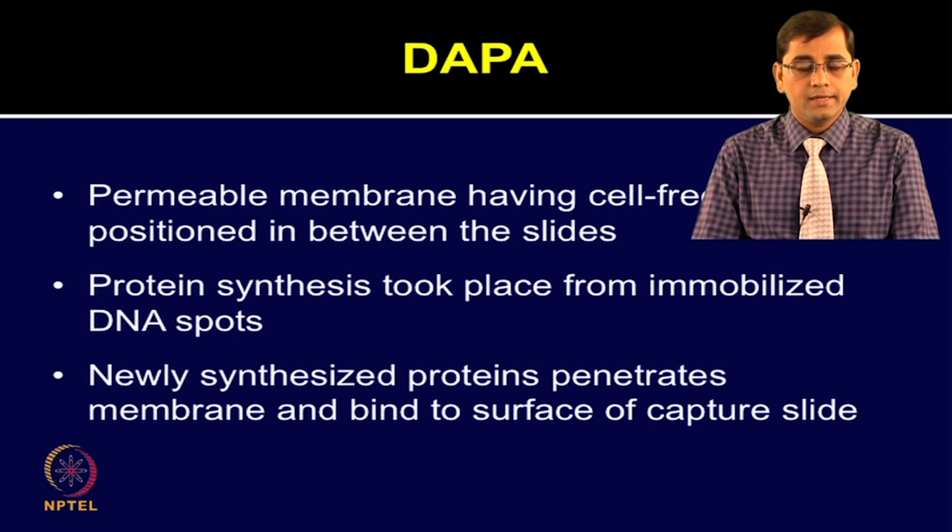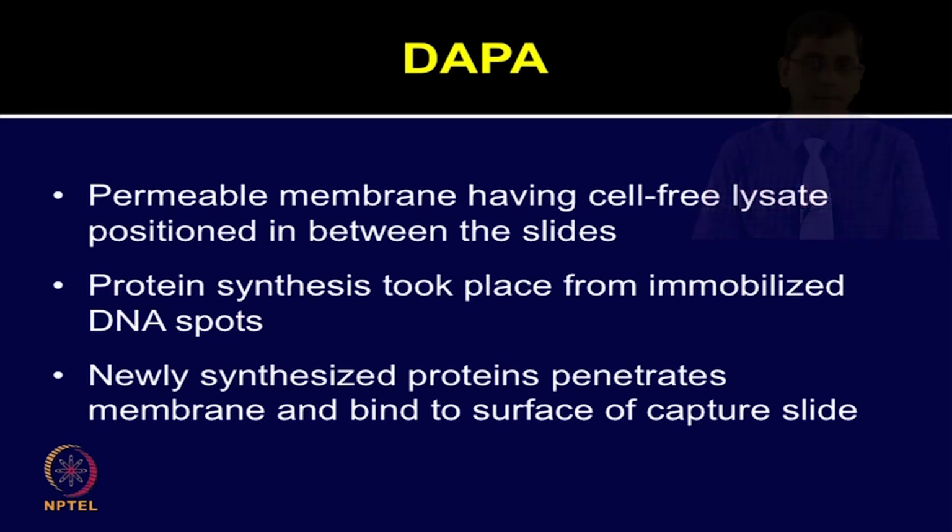Protein synthesis takes place on this membrane and then the synthesized protein diffuses from the membrane and moves on to the other slide for capture. The newly synthesized proteins penetrate the membrane and bind to the surface of the capture slide.